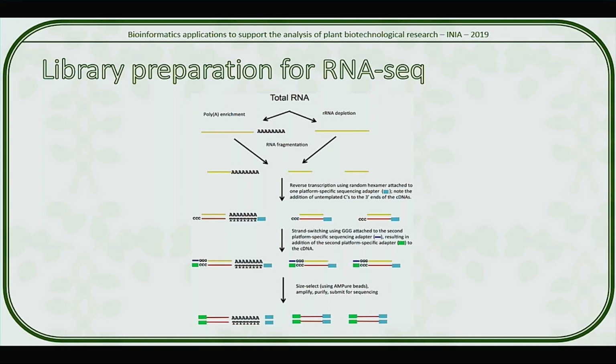Now RNA-seq basically is using the same library construction or RNA extraction methods we already knew, but instead of cloning, subcloning, and sequencing based on the vector sequence, we're going to use massively parallel or high throughput sequencing machines, like 454 at some point, Illumina nowadays, to produce millions of reads from all the transcripts or the transcript pieces that are in an RNA extraction.